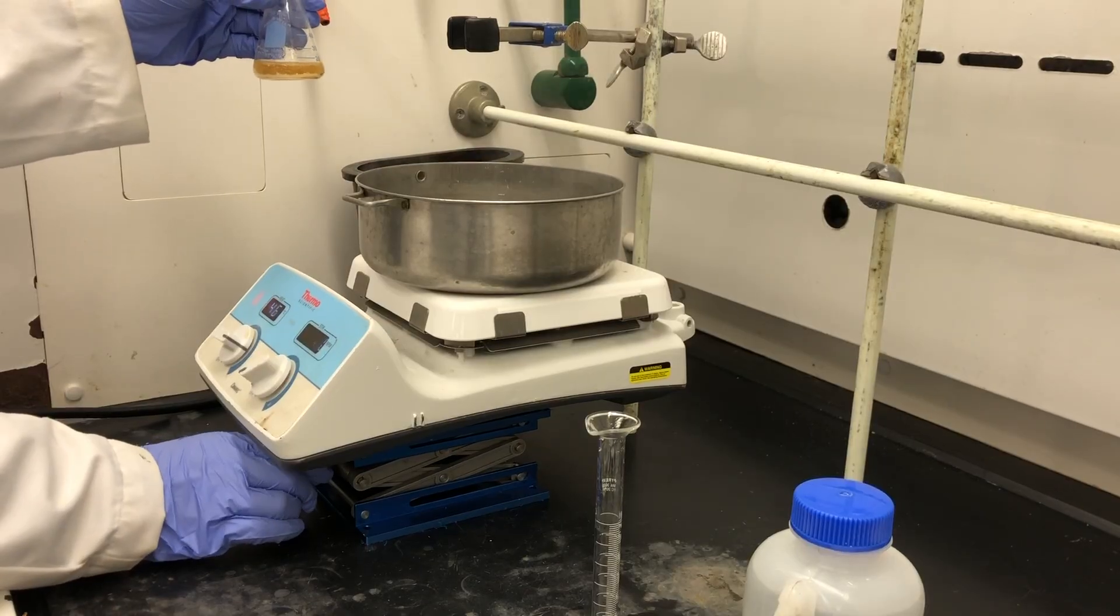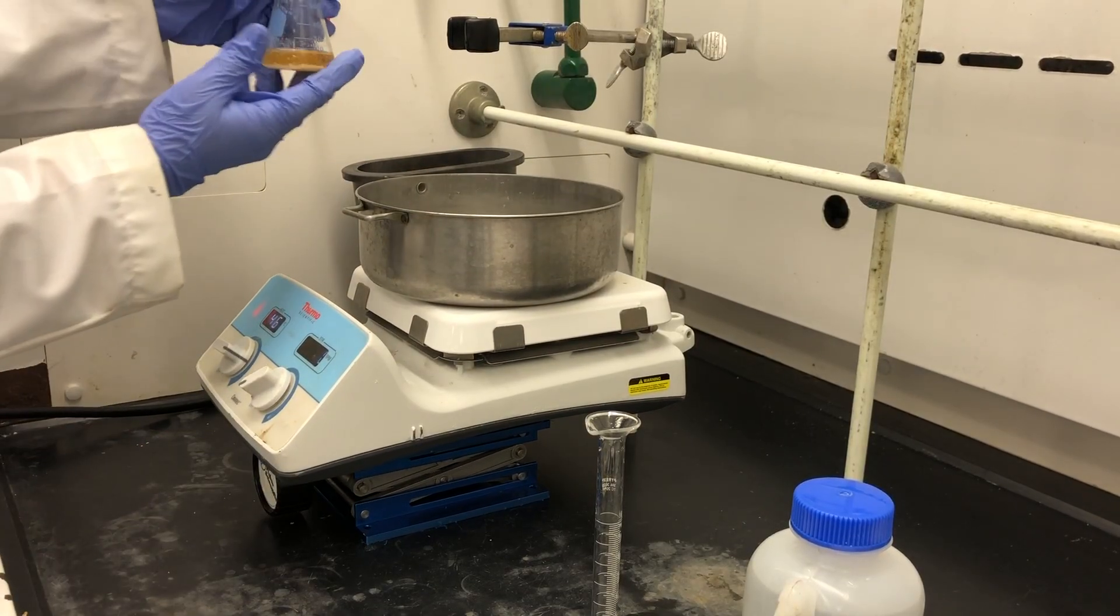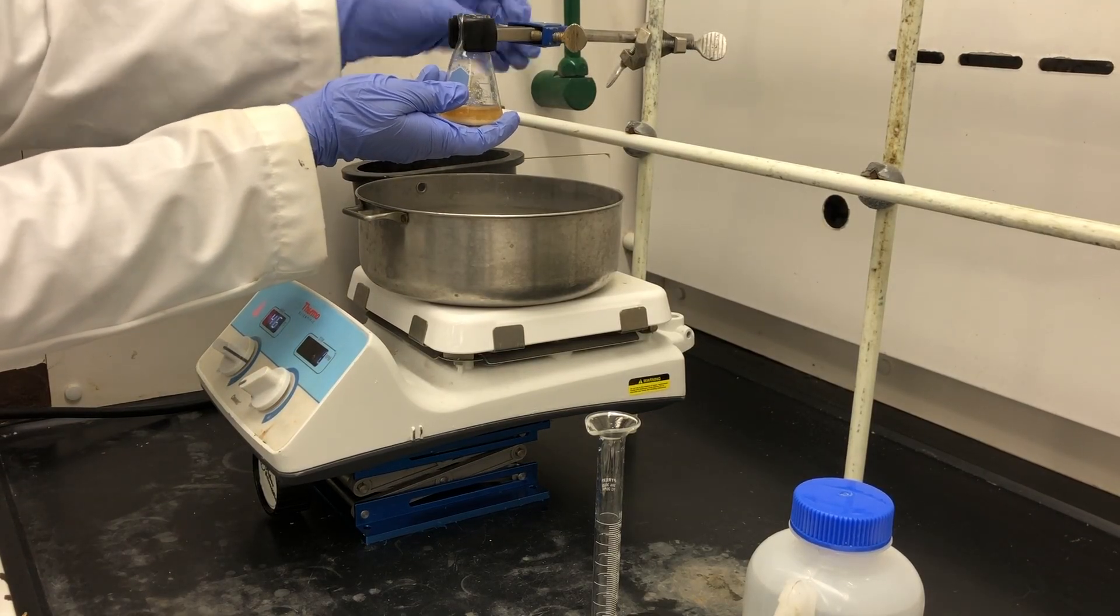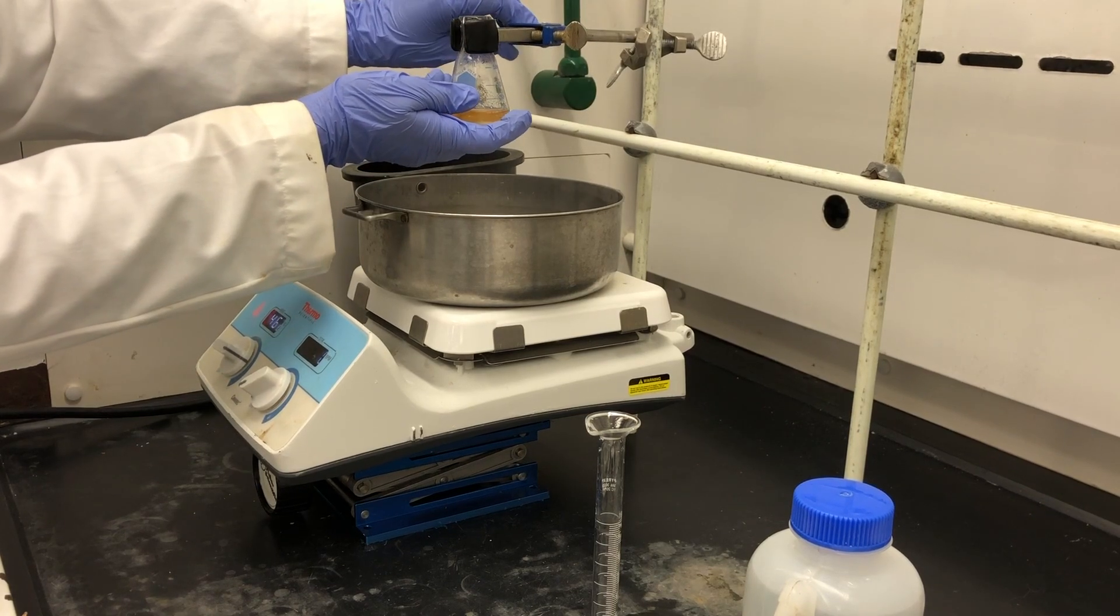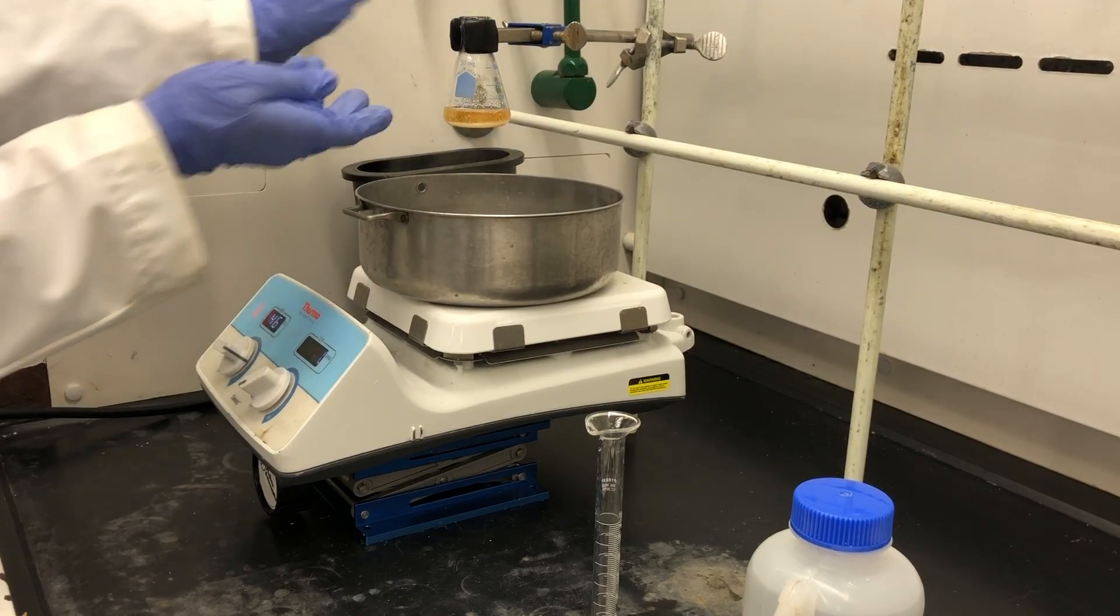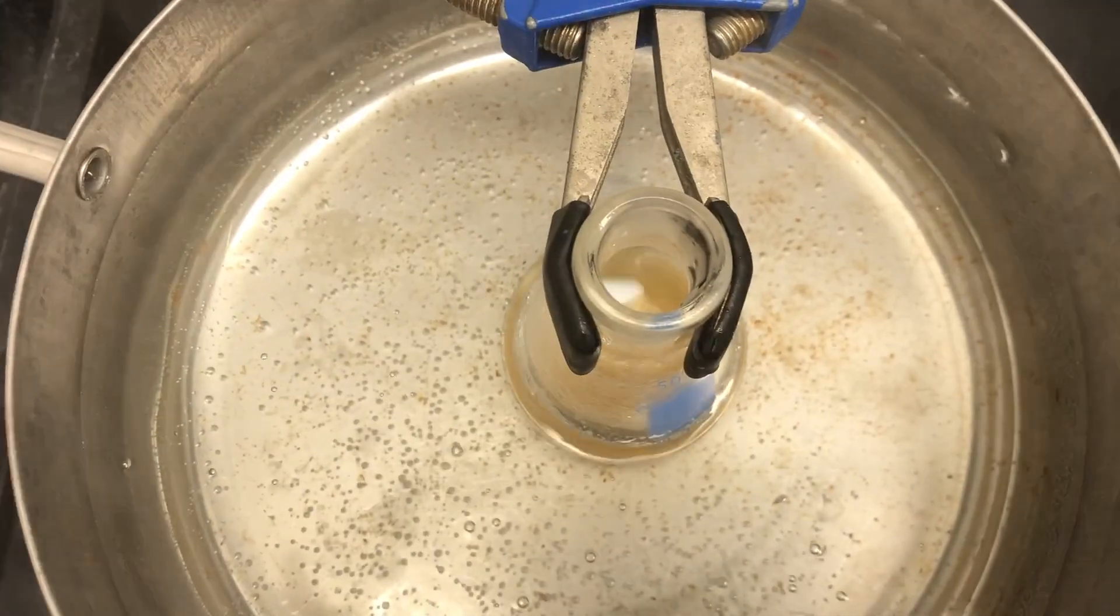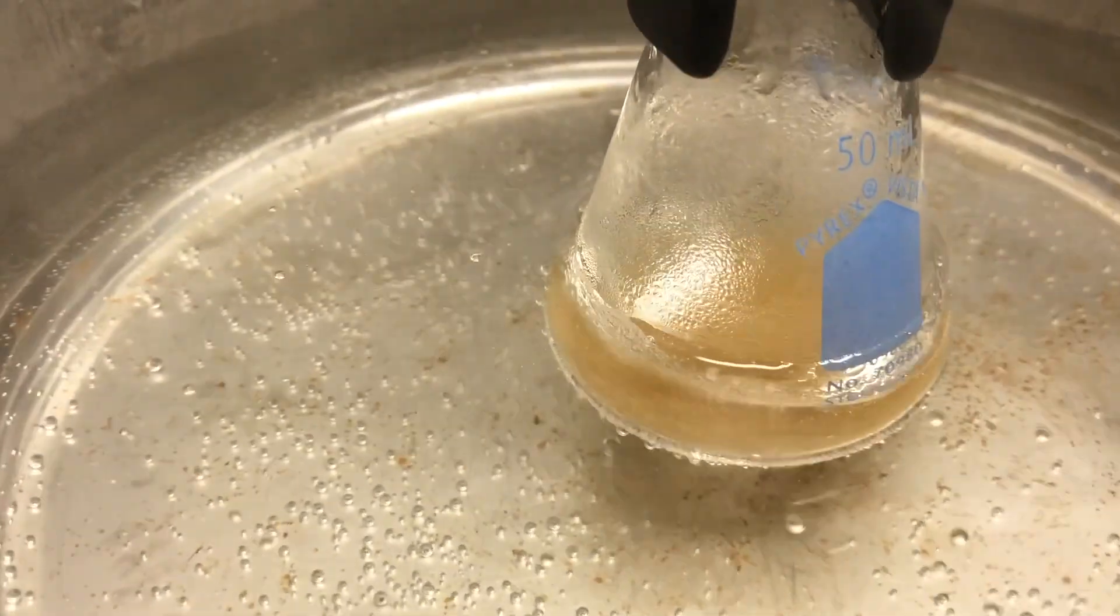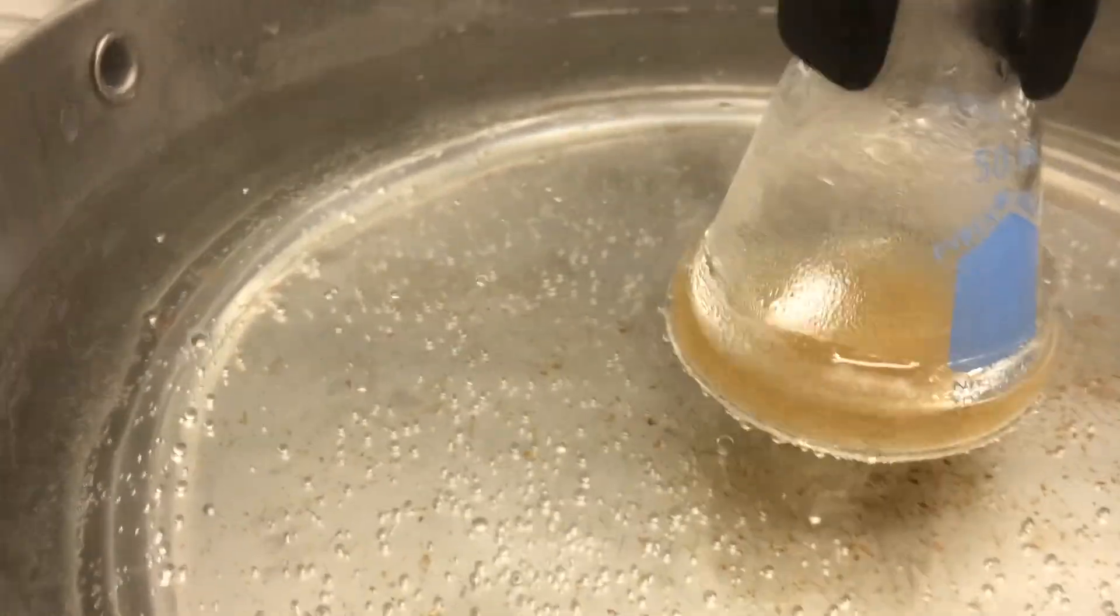That clamp is going to hold it right at the neck of the flask, and then you lift the jack back up. Notice the color of the reaction mixture.